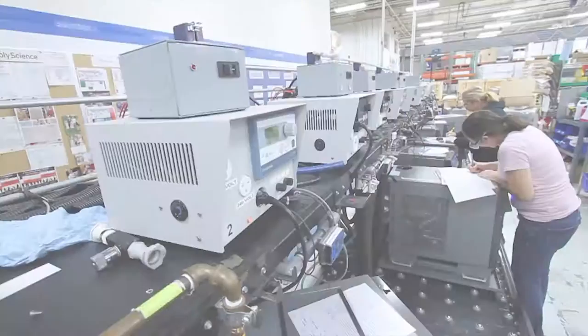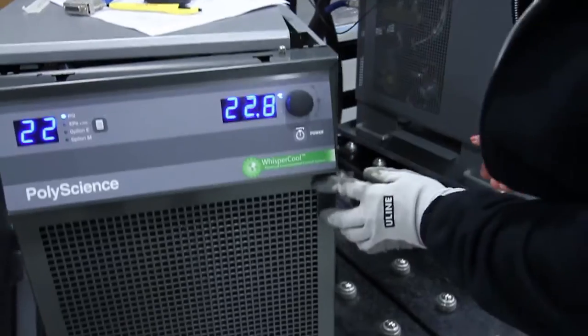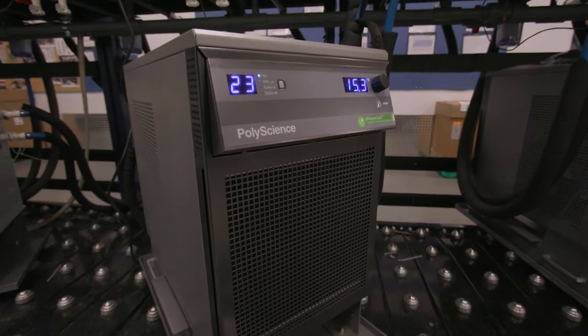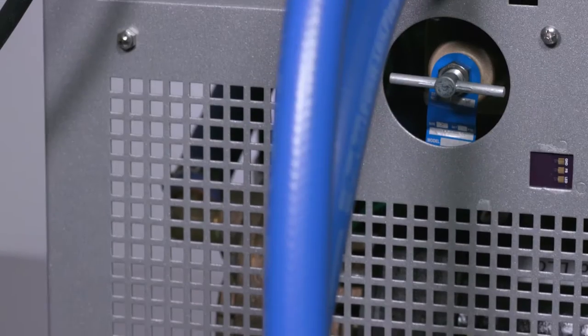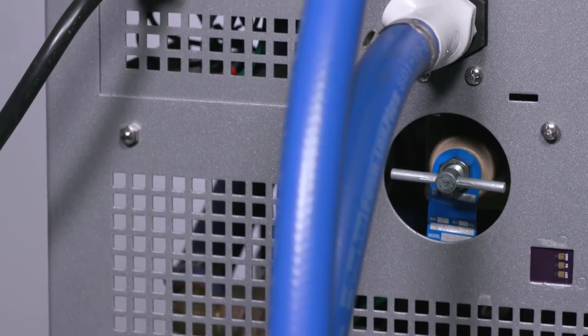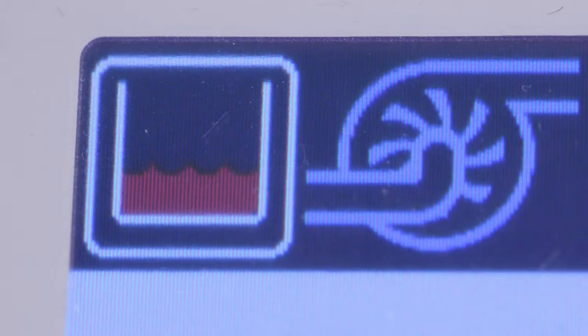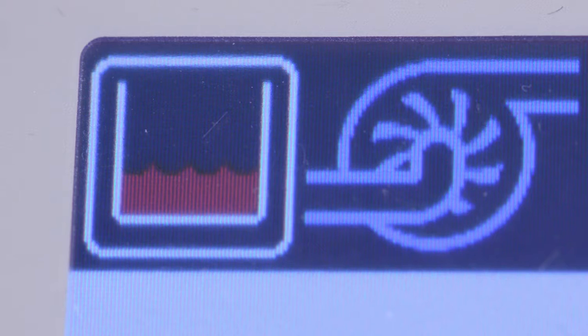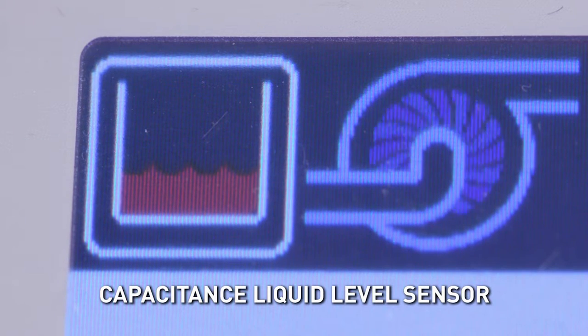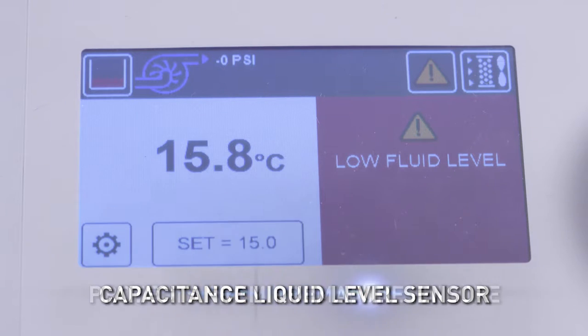innovation, and the reliability that has always been a PolyScience cornerstone. Because pump seals will fail in as little as 30 seconds of being run dry, DuraChill chillers include a state-of-the-art capacitance liquid level sensor on the reservoir to protect the pump from premature failure.